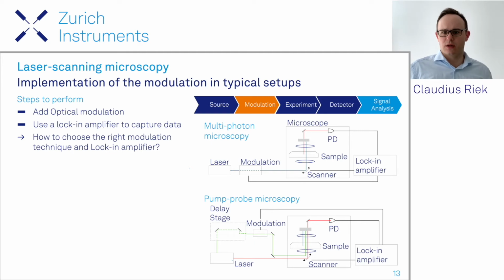So here, the laser has two sources: the probe beam, which goes through in red, and the pump beam. And we only now modulate the pump beam because the pump beam will, together with the Raman interaction, imprint a signal onto this probe beam. Now in the SRS you could do it the other way around. For example, there you would modulate the Stokes beam and imprint, in this case for example, a pump loss onto the signal, and this is what you detect afterwards.